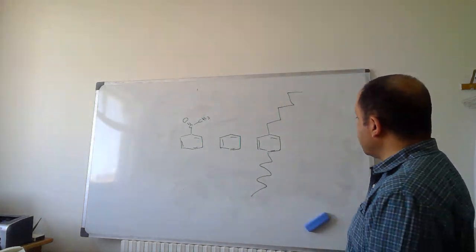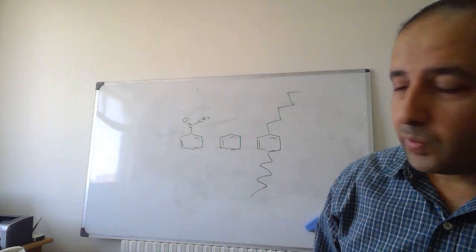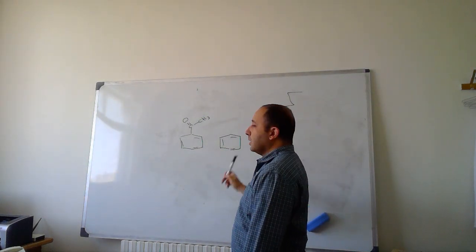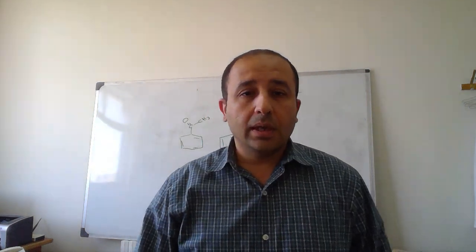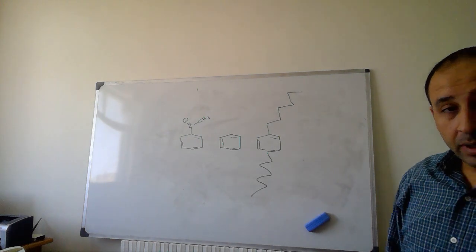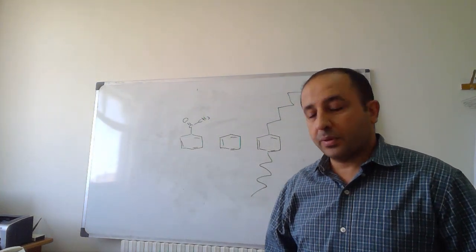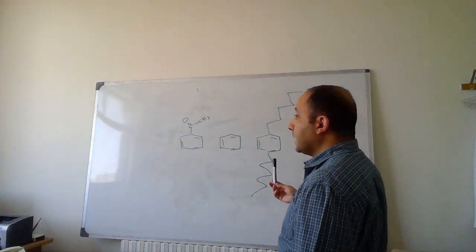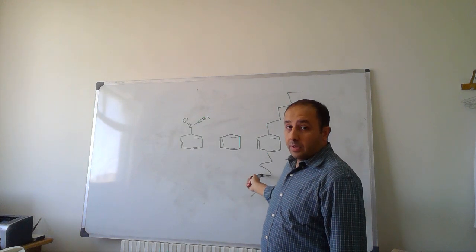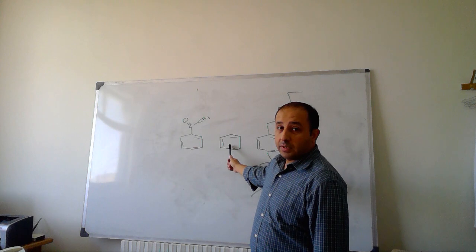Now it's easy to see that there is no chance for ion exchange. We have a ketone here, we have benzene, and here a phenyl with two big alkyl moieties. There is no chance for ion exchange. There is no chance for normal phase because there is no functionality capable of forming a physical interaction with the stationary phase, and the same thing for benzene.